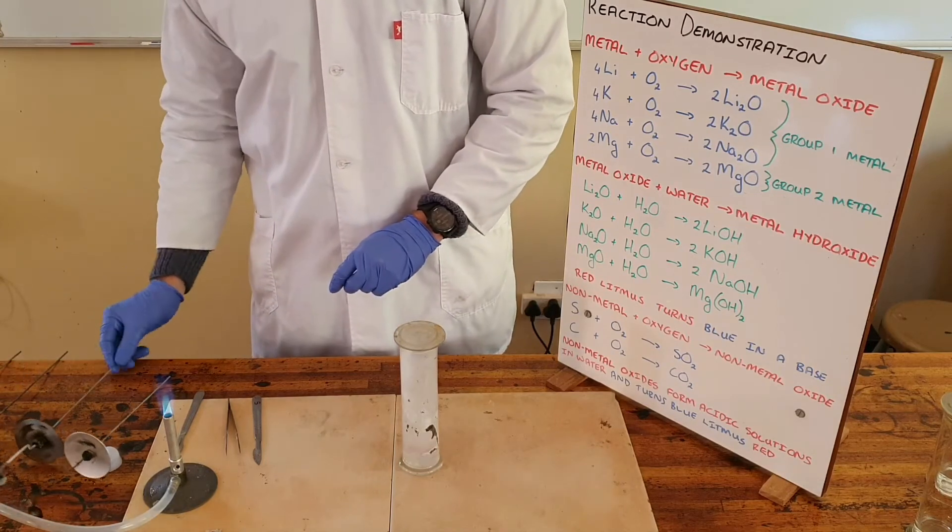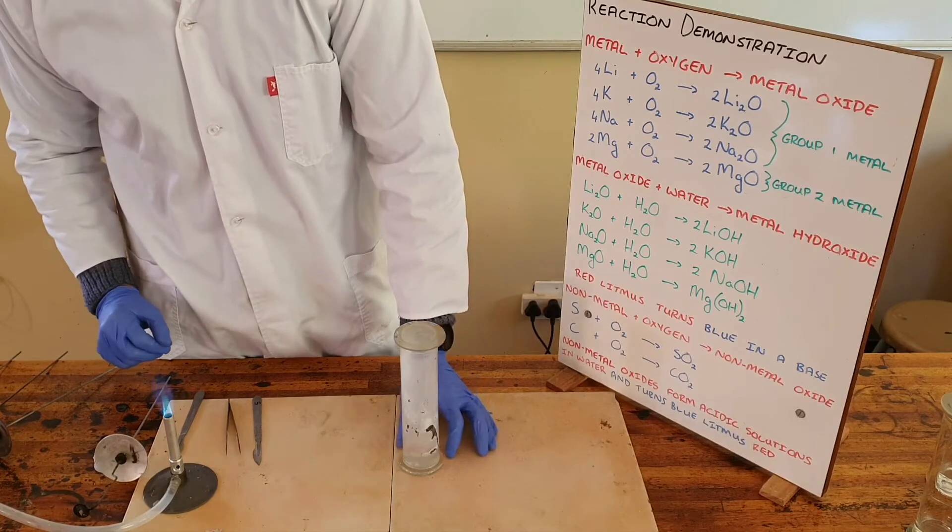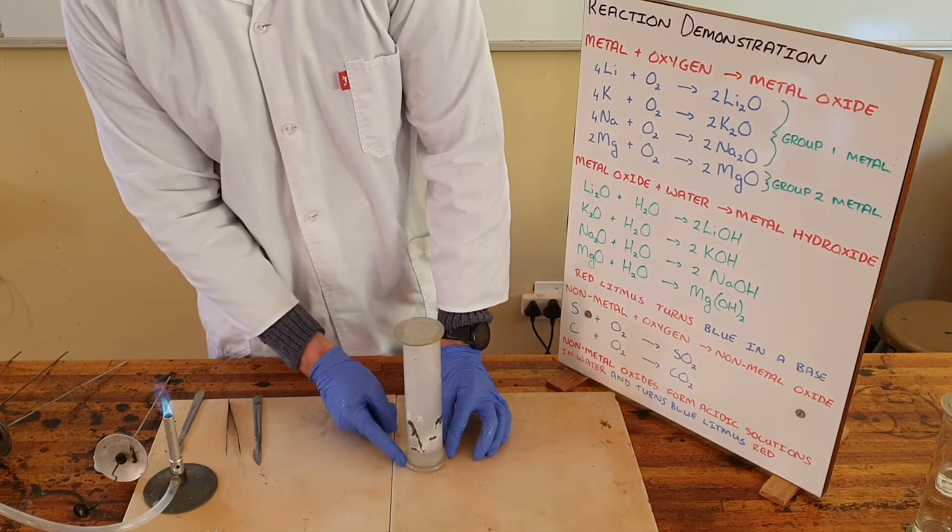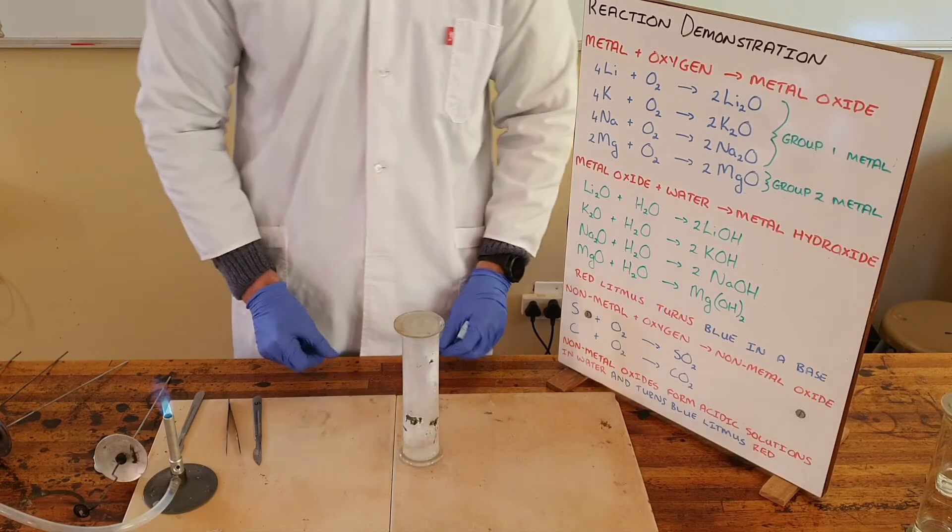We can see here—it's difficult to tell because the gas jar is so hot—but we can see that the red litmus paper does turn blue, which shows that magnesium oxide in water has formed a basic solution.